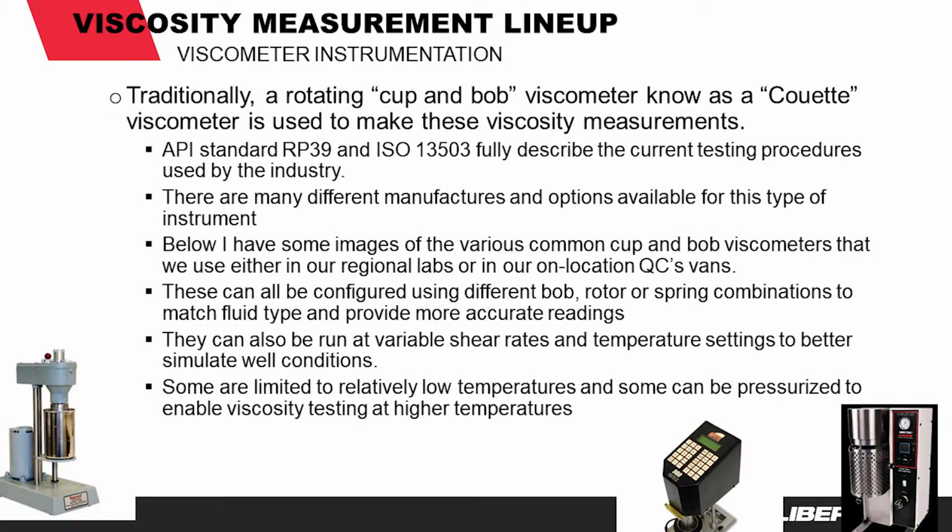Below, I have some images of various common cup and bob viscometers that we use either in our regional labs or in our on-location QC vans. These can all be configured using different bob, rotor, or spring combinations to match fluid type and provide more accurate readings.